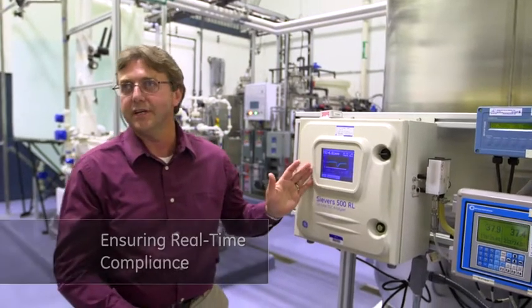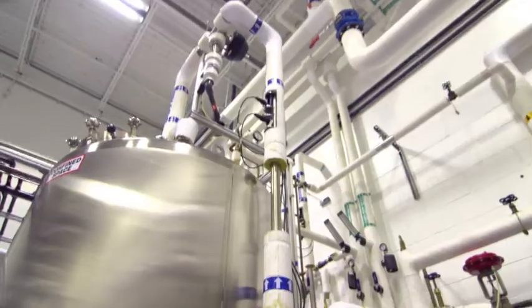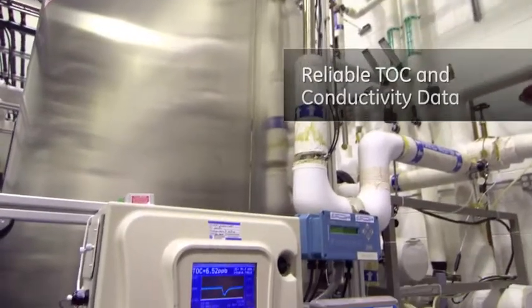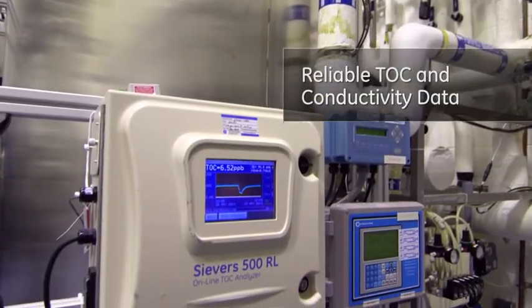What this is right here, this is a TOC monitor, total organic carbon. So we're measuring a certain quality of water online as the water is leaving the tank and returning to the tank. So at all times we can see what the quality of the water is from a TOC level.